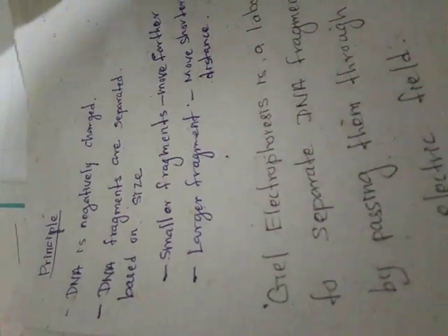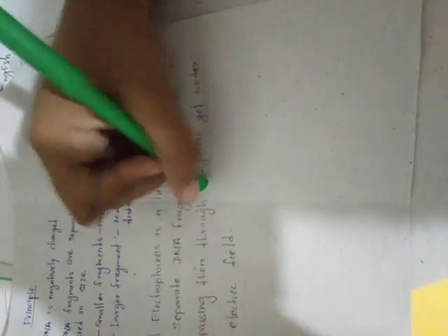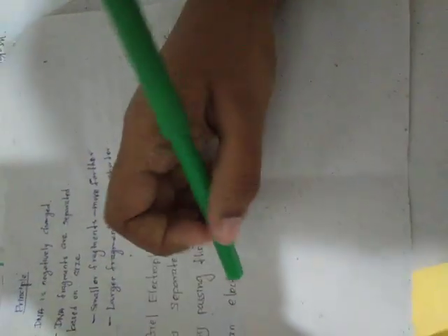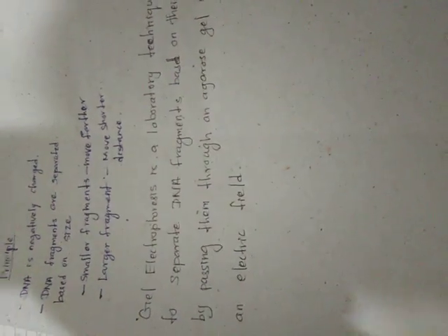So now when we look at the definition, you can understand thoroughly. Gel electrophoresis is a laboratory technique used to separate DNA fragments based on their size by passing them through an agarose gel under an electric field. So now you can understand clearly. So we can finish this.